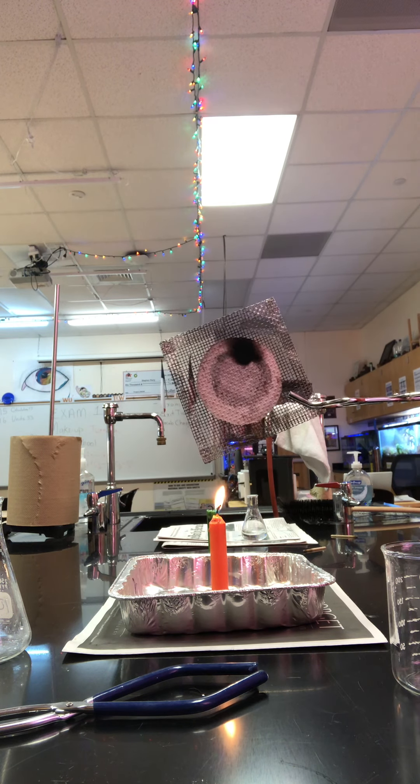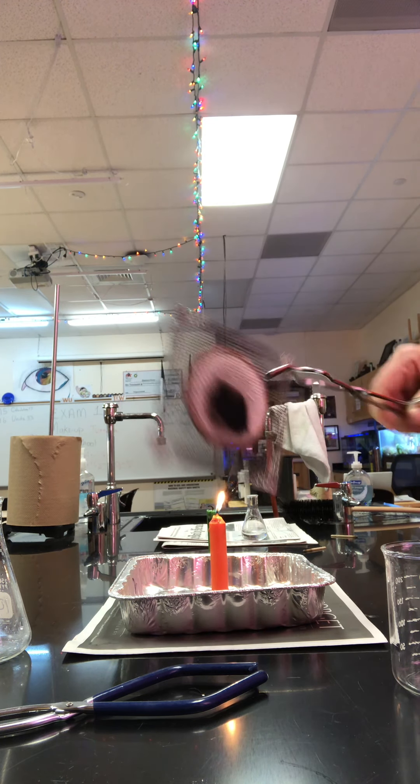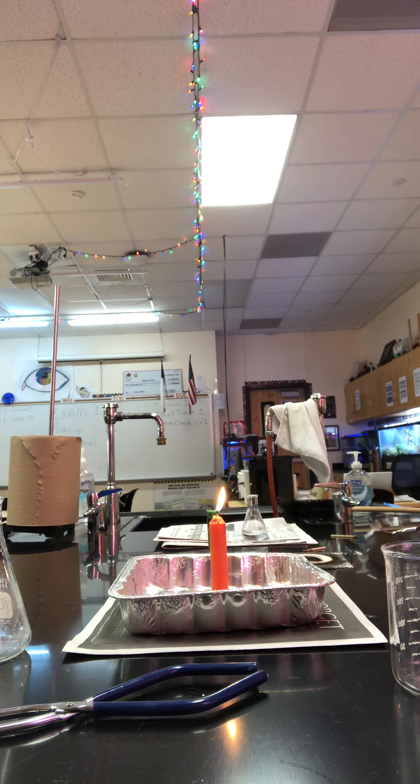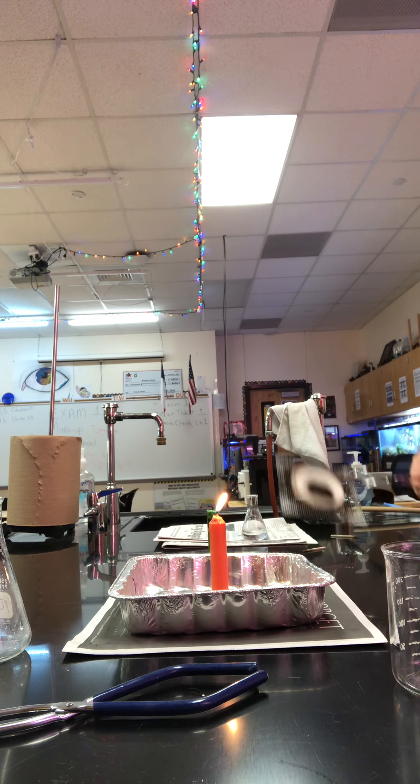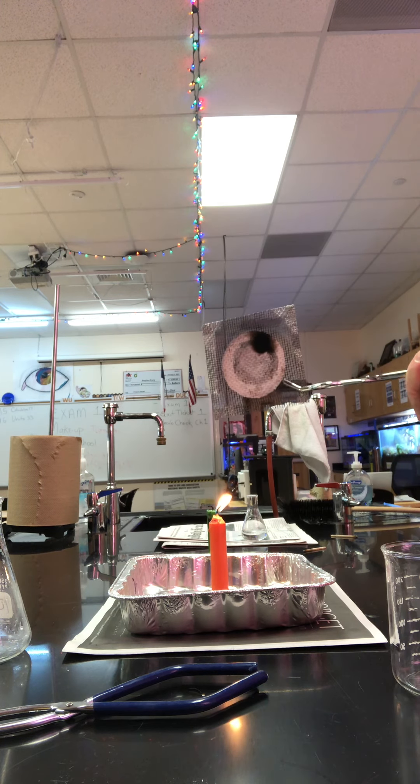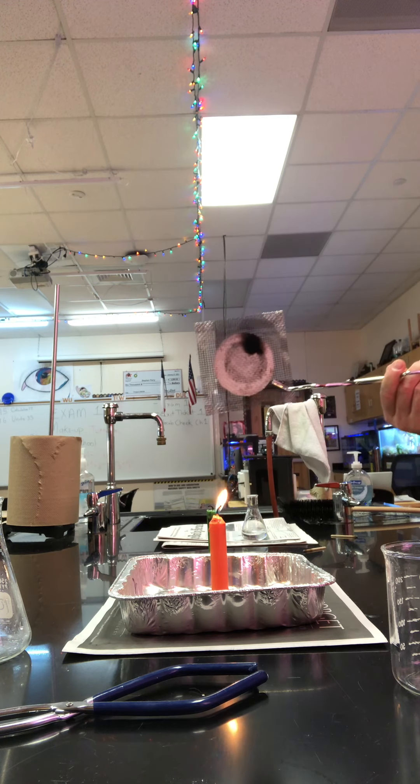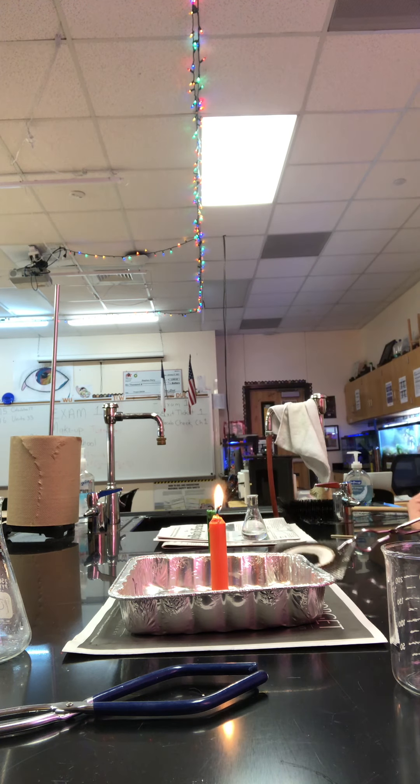And then also makes this black stuff on there. So that's soot. If you're into art, or if you buy paint or ink, you can still buy lamp black. Lamp black is literally originally soot collected from lamps. So the carbon in your candle didn't completely burn and is redepositing itself on the wire gauze.